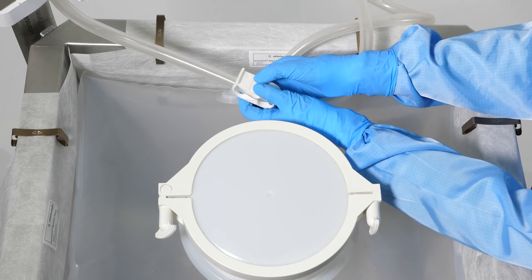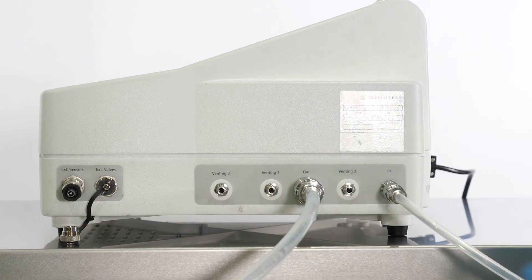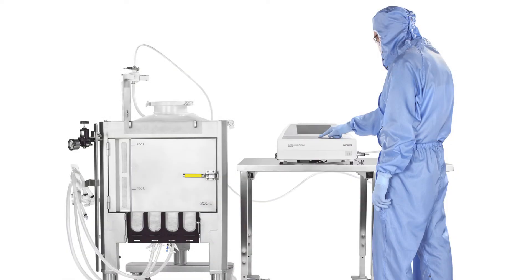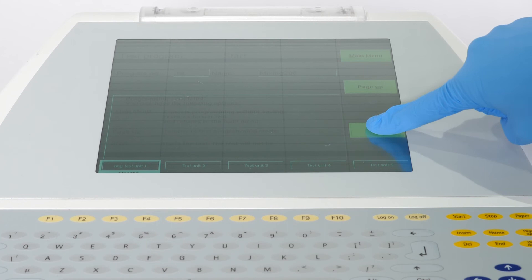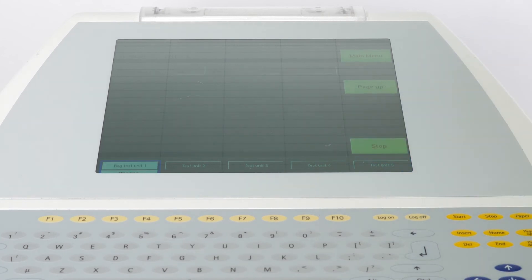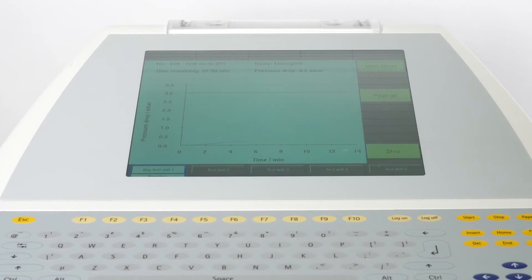Clamp the air filter line, disconnect the testing tube, and connect it to the outlet of the Star2Check 4 Plus bag tester. Open the compressed air supply and press the start button. Once you hear the Star2Check 4 Plus bag tester interval valve switch on, open the clamp on the filter line. The test is now running.